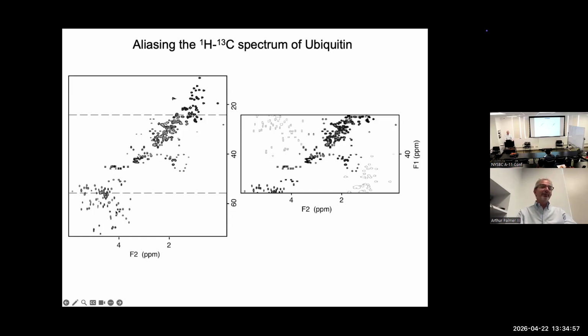Let's suppose, depending on how the software works, that up here was minus 90 and down here was plus 90 to get 180-degree first order phase.